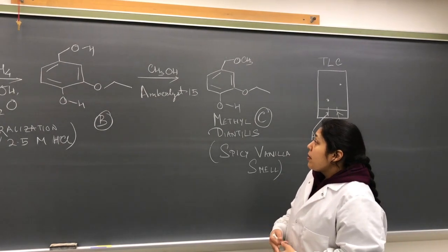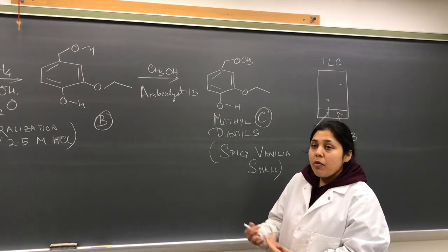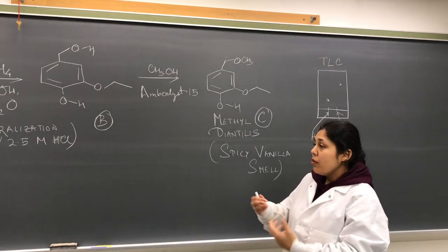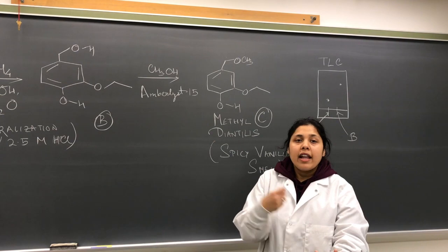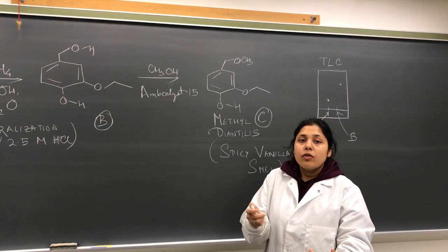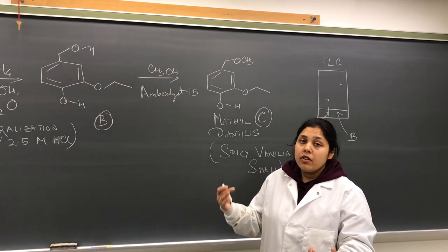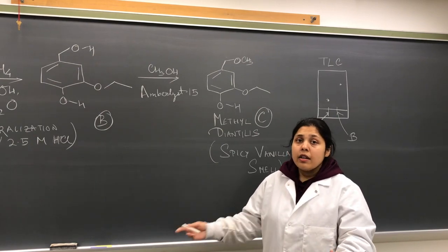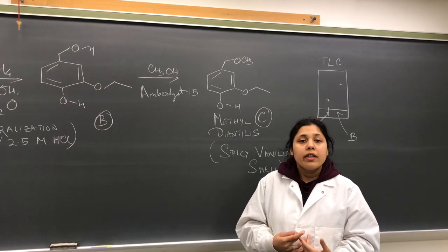The second step, we're also going to similarly monitor using TLC. We're going to pull out aliquots every now and then and test whether the reaction is complete or not. If it's not, we're going to continue the reaction. If it's done, that's great. Then we're going to go for our next step.